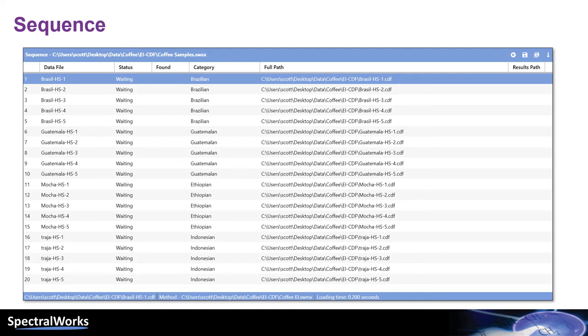If we put the slides together, we can see how easy it is to process the data. First, we loaded the data files into Analyzer Pro XD to create the sequence. Then we added category information. Finally, we clicked on the process button.